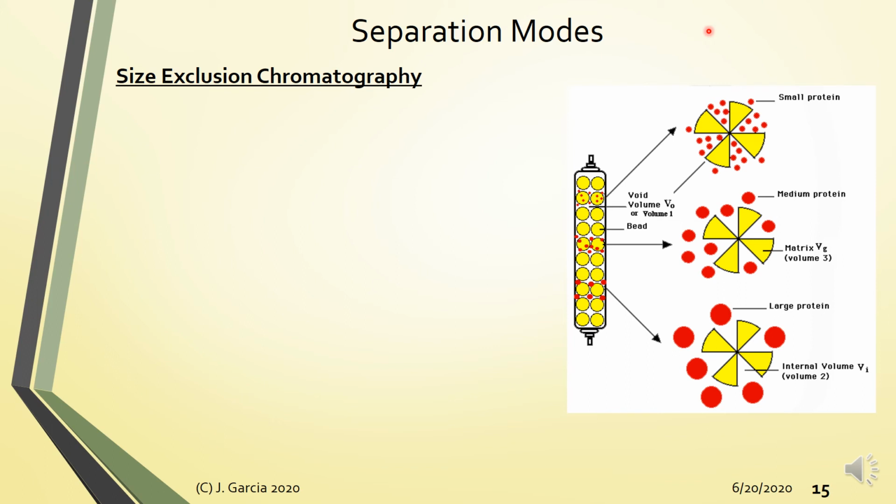So here, as the name implies, we are separating the components of the mixture based on their relative sizes, or relative molecular weights. That is why SEC is widely used for the analysis of polymers and biomolecules. So ito yung mga malaking molecules, so macromolecules. More for determining molecular weights. Yeah, molecular weight determination. So again, the separation is based on molecular size.